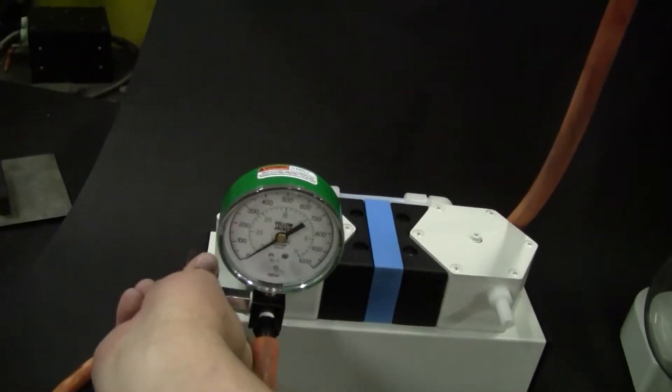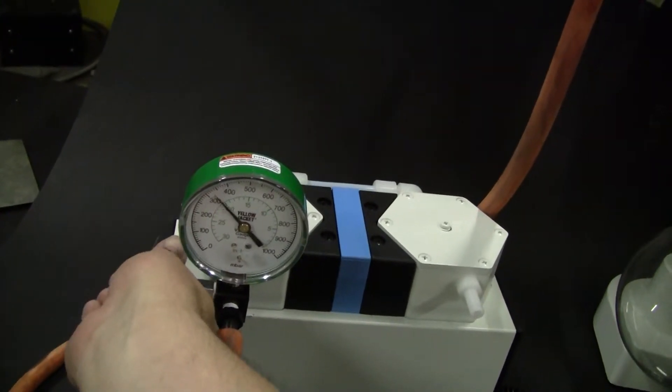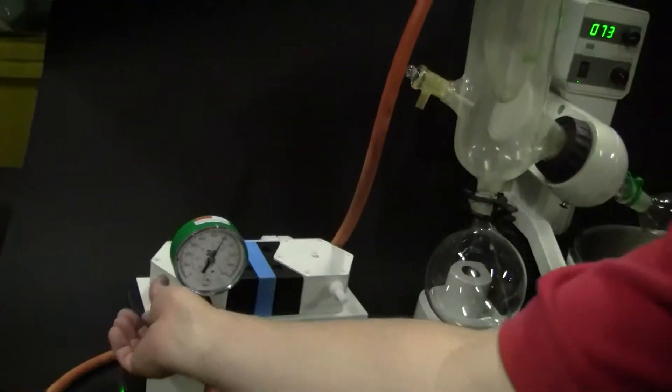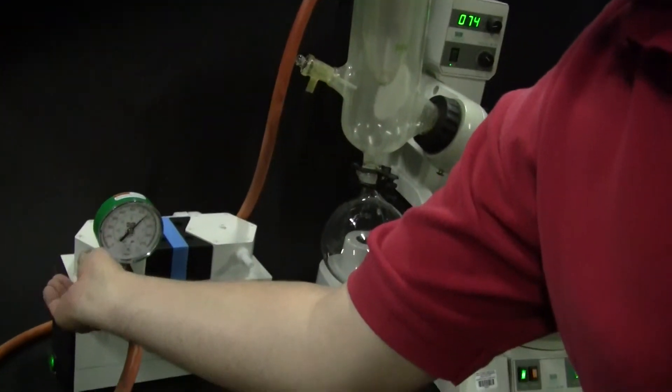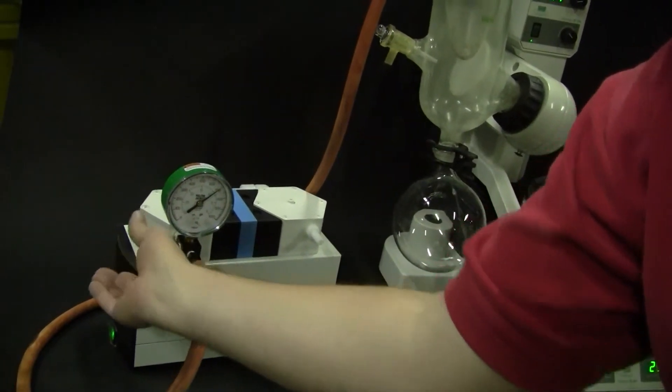So if you want to lessen the vacuum, you can actually control the vacuum a little bit when doing your evaporation. Find a nice middle point. Look at that.